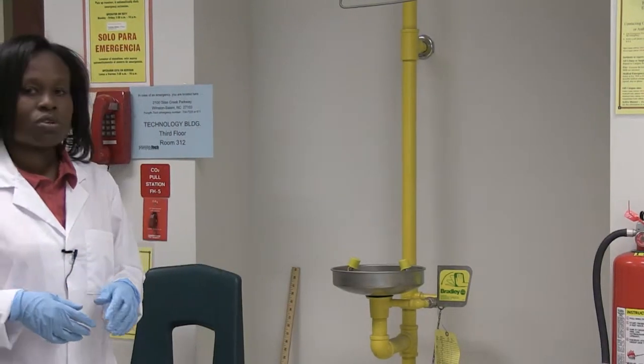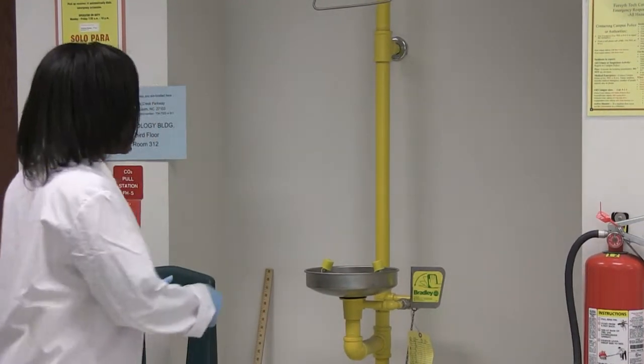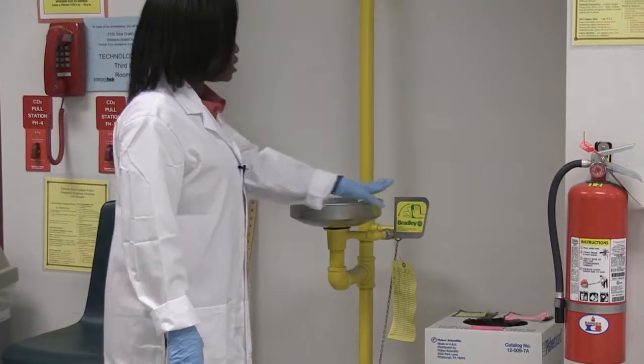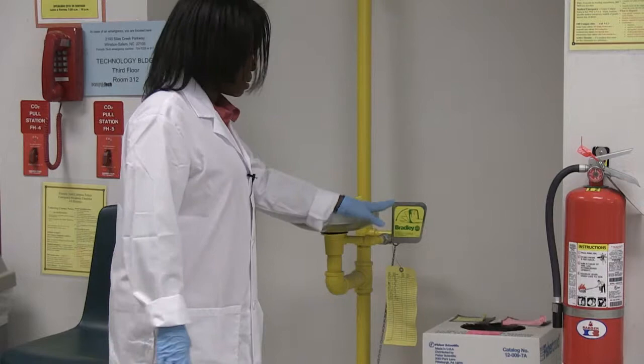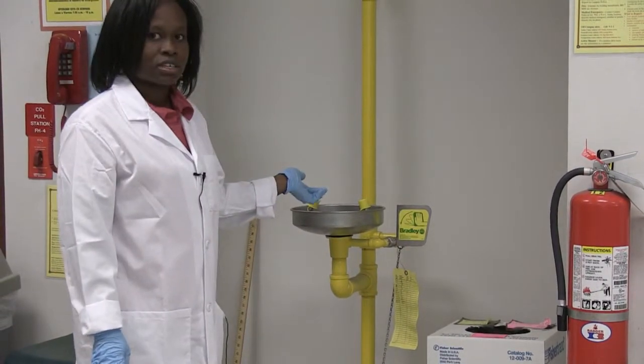If you are working with a chemical and the chemical gets into your eyes, the first thing you want to do is get assistance from either your instructor or a neighbor. Get immediately to this eyewash station and you may have to get your neighbor to press the pedal forward so that the water will come out of the eyewash station.